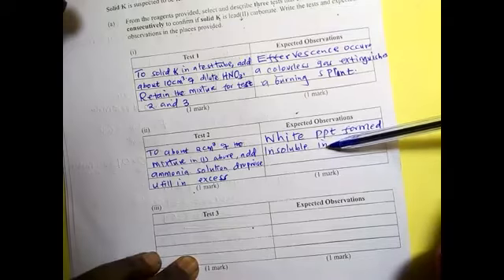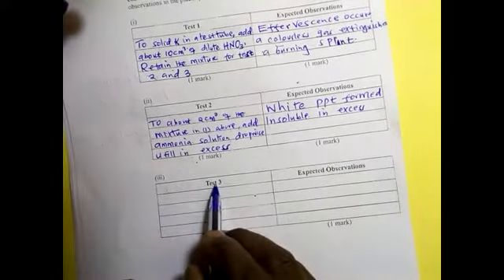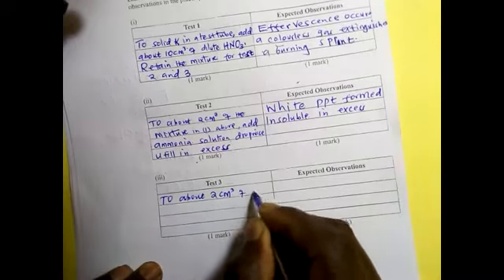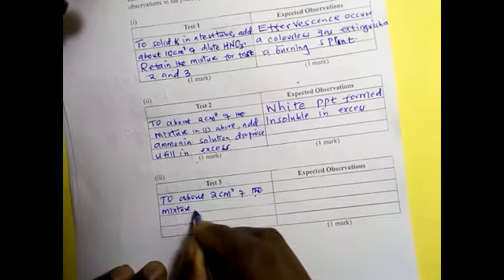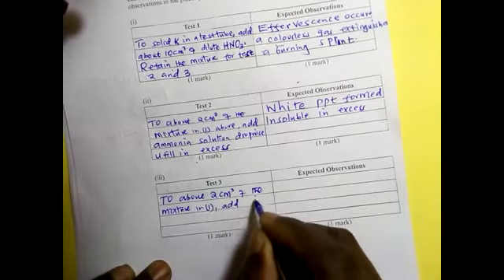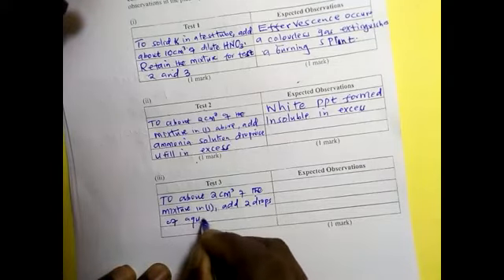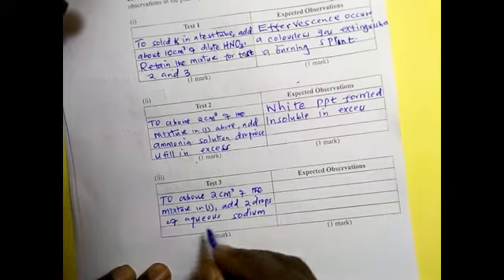Let us go to test 3. Now to about 2 centimeters cube of the mixture in Room 1, add 2 drops of aqueous sodium sulfate.